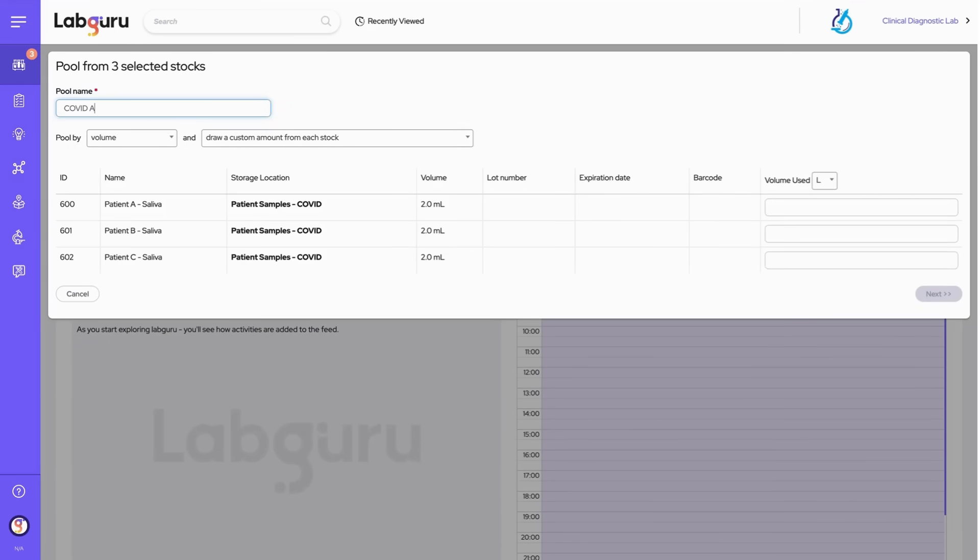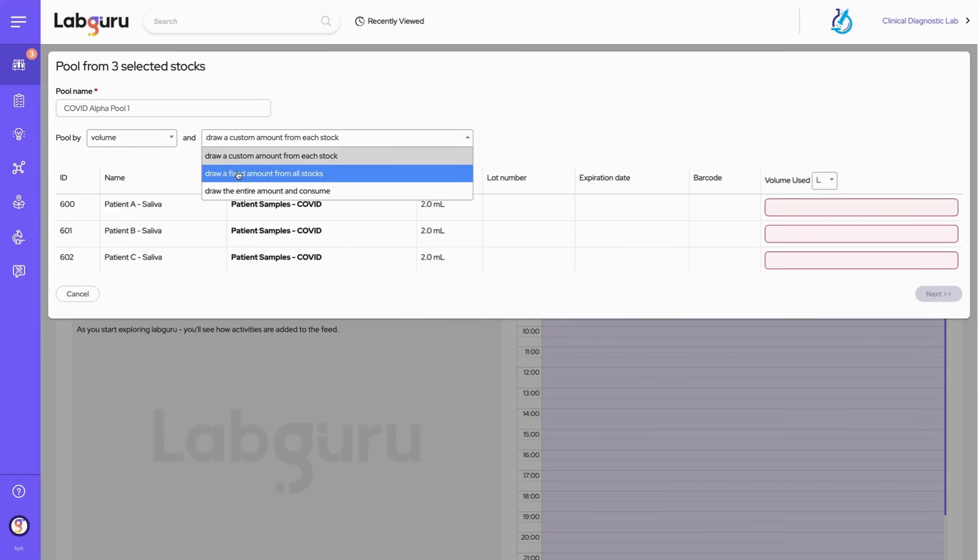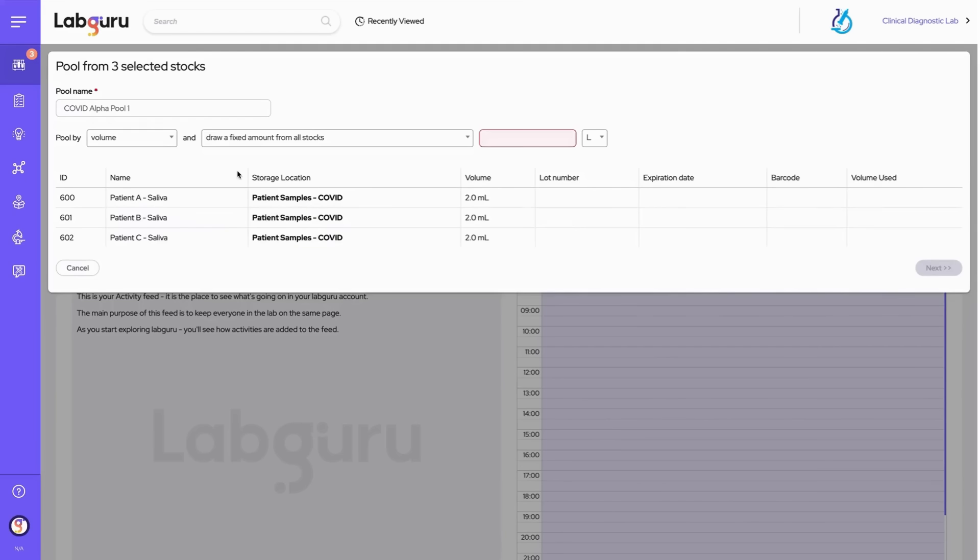To keep everything organized, we'll give this pool a name, allowing us to easily track this specific combination of samples. Now we decide how to pool the samples. In this case, we draw a fixed amount, two milliliters, from each sample, resulting in a total pooled volume of six milliliters.